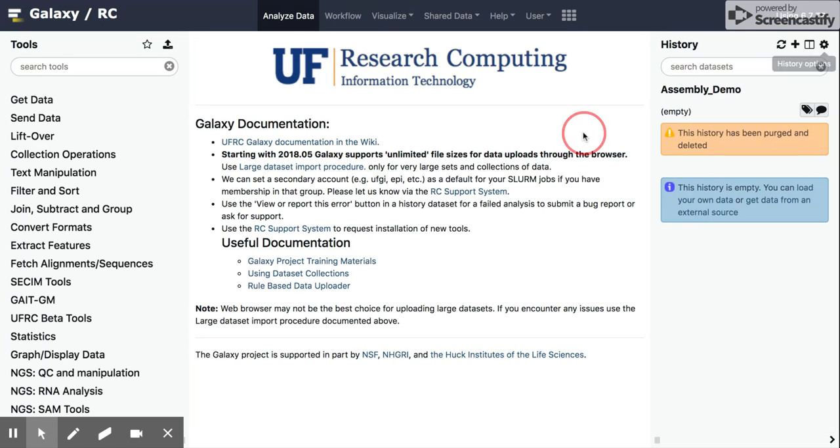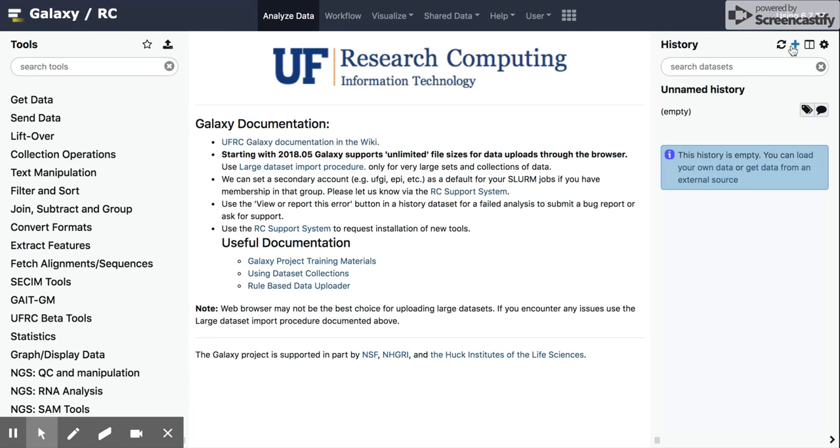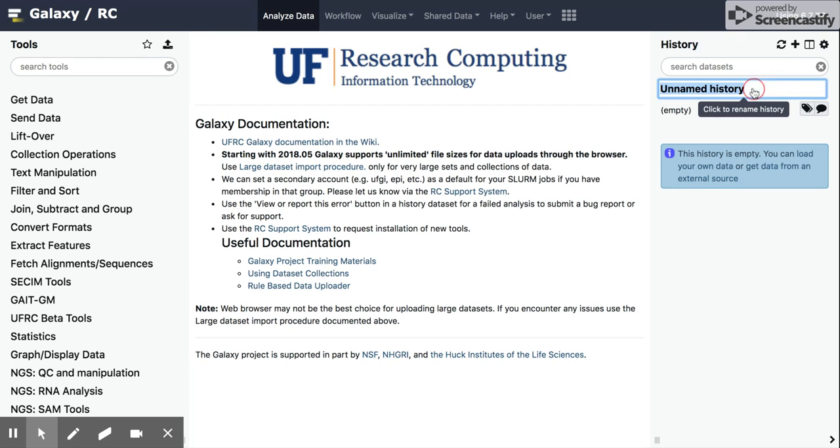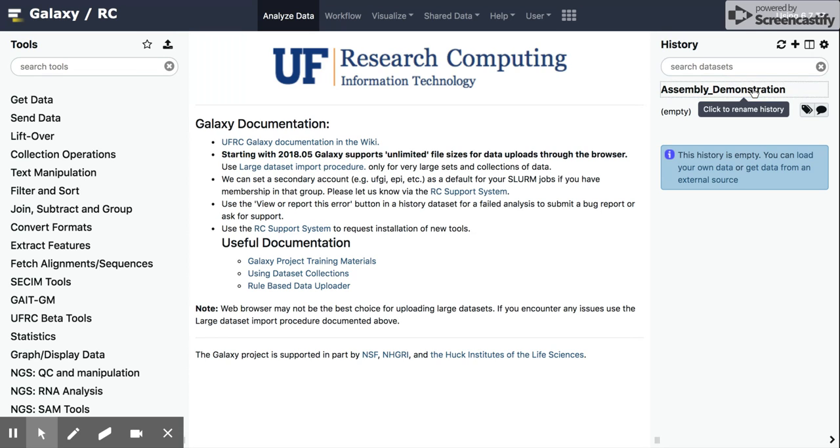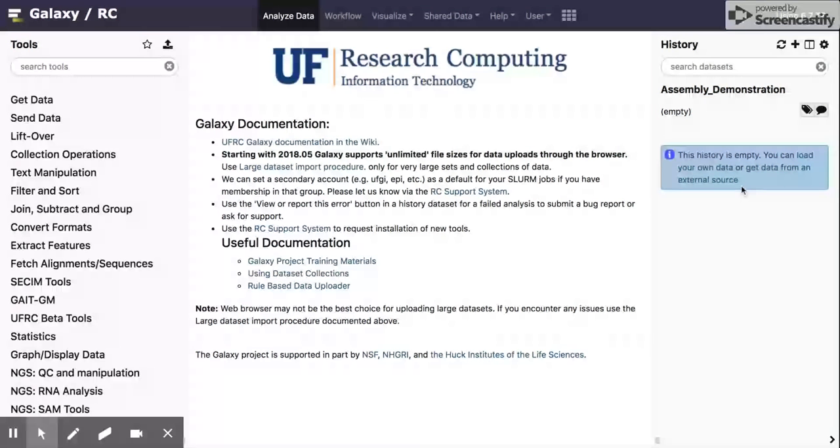So the first thing we're going to do if we're going to want to create a new history, we can click on this plus button. And it will come up with a new history that says unnamed history. And then we can change the name by highlighting that field and typing in it. Assembly demonstration, we can call it, hit enter, and that will then create this new history.